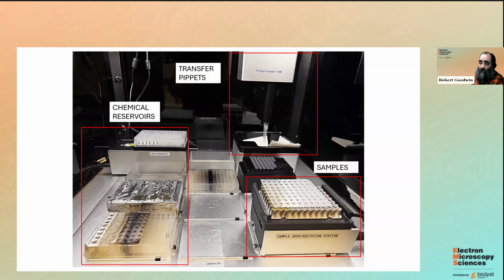I've tested it, and about the only time that I found that you really do need to prolong the dehydration phase is with nerve biopsies. They tend to be a little more resistant, and the ones that we get are very large as well. They're very rare, we don't get them a whole lot, so we'll still process those by hand and elongate the dehydration phase on those. But yeah, 20 minutes in osmium, and you can see the contrast that we were getting is just fine.